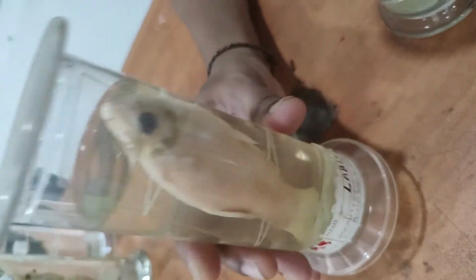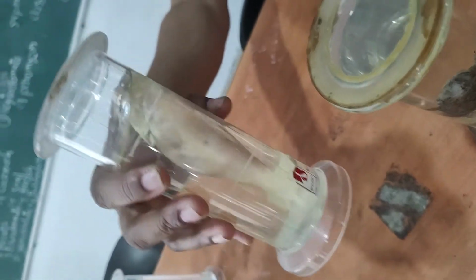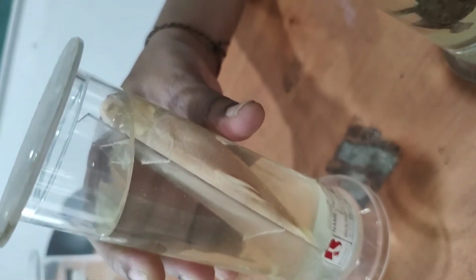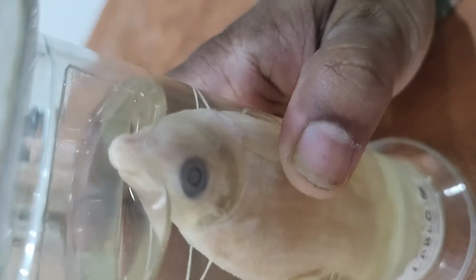Then the tail is formed of two equal arms or two equal lobes, so they have the homocercal or symmetrical type of tail. Then 4 pairs of gill slits are present, and these gill slits are covered by the operculum. You can see here the operculum is also present, which covers the gills.